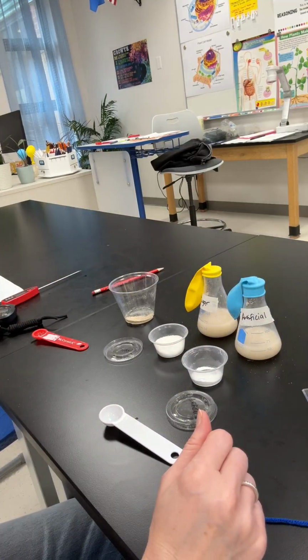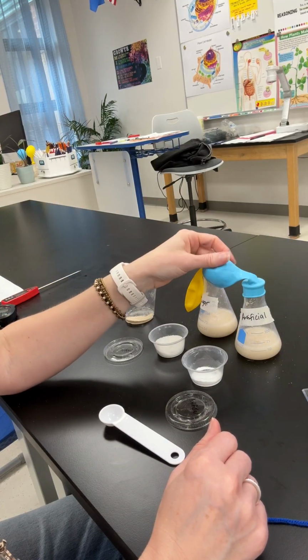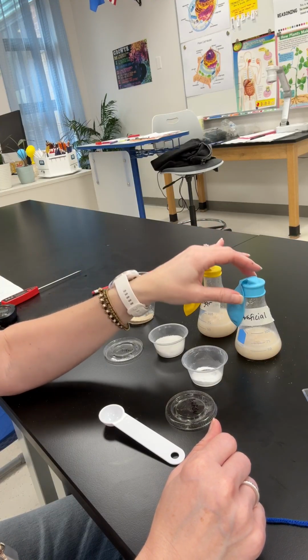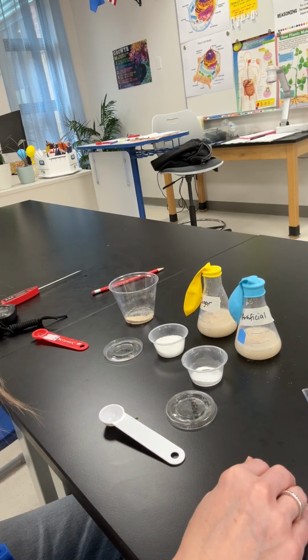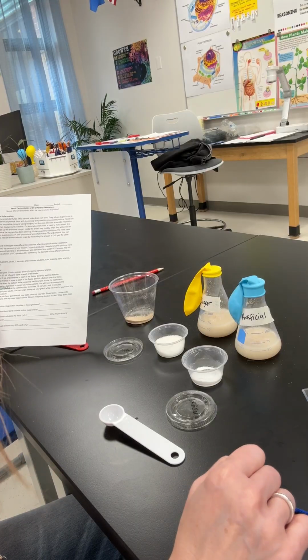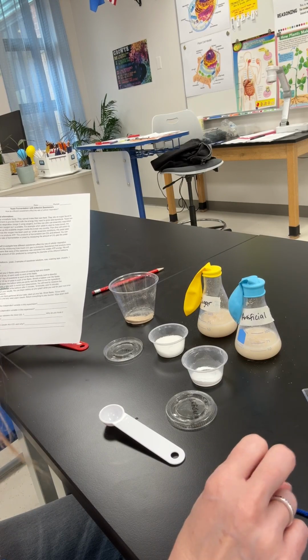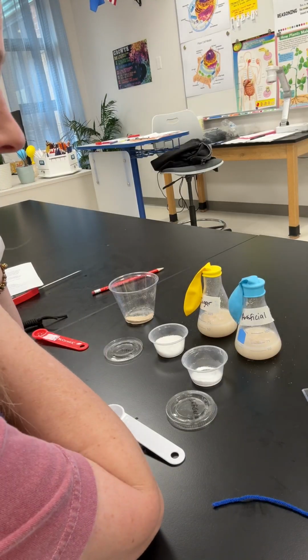Now we're going to set a 5-minute timer, and then we're going to measure the circumference of our balloons to see if we've had any change. Then we're going to do the same thing after 10 minutes and after 15 minutes. On your paper, step F says create a data table to record your observations. You will need to measure the diameter of the balloons after 5 minutes, 10 minutes, and 15 minutes. You also need to include that starting, or 0 minutes, time.